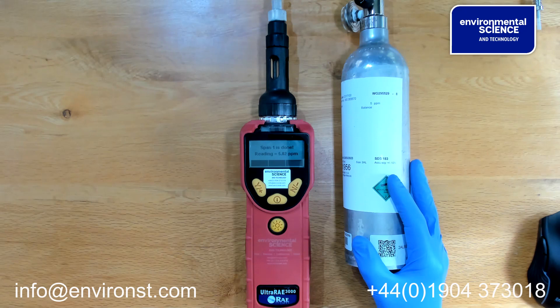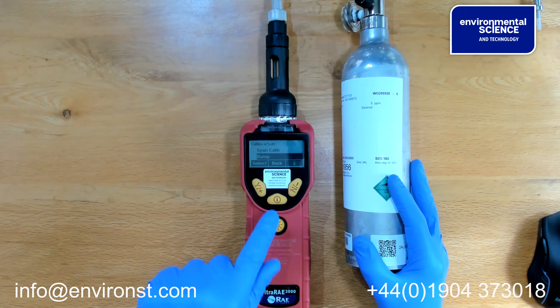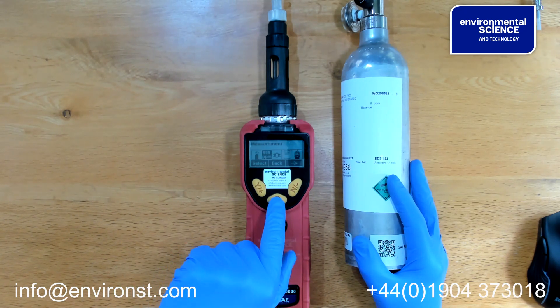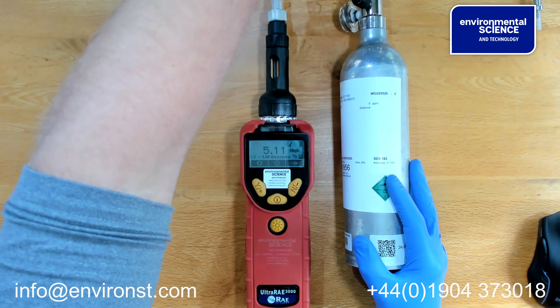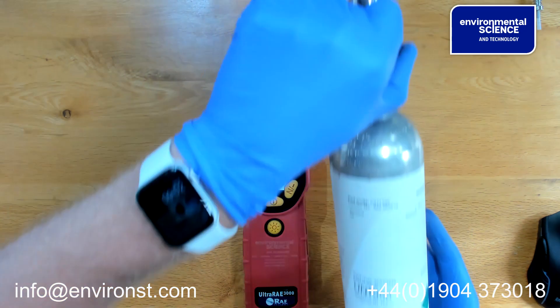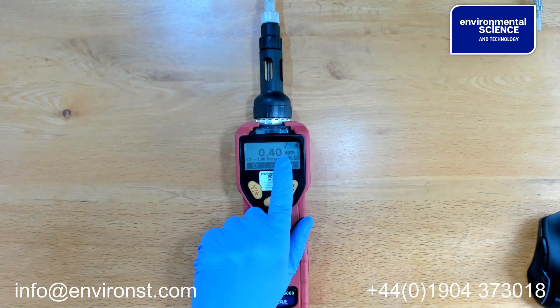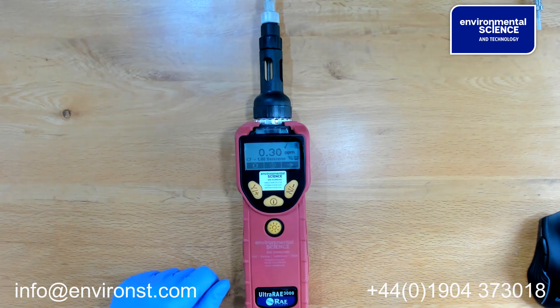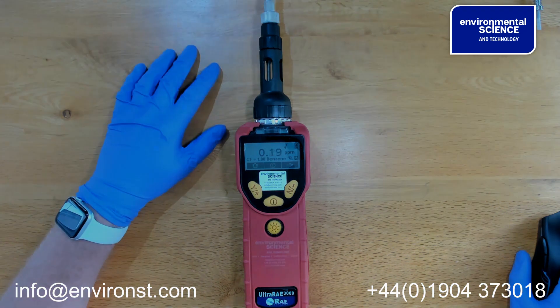Once the unit has finished calibrating, it will come up with a span reading and then flick back to the previous menu. Press back and back again, then remove the calibration gas. You will see that a tick has now appeared, which means the calibration has been successful and complete. You're now ready to use your unit.